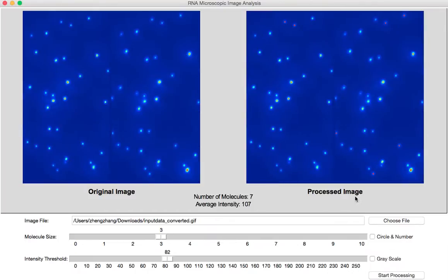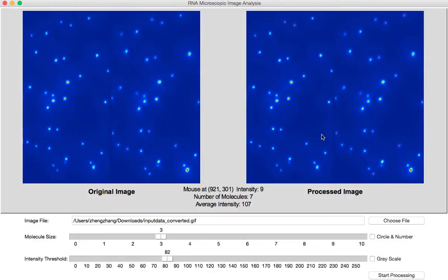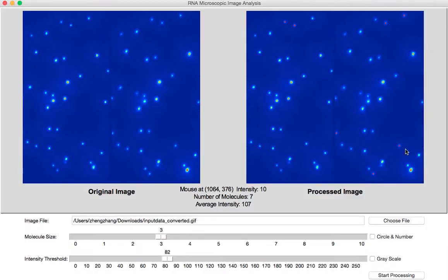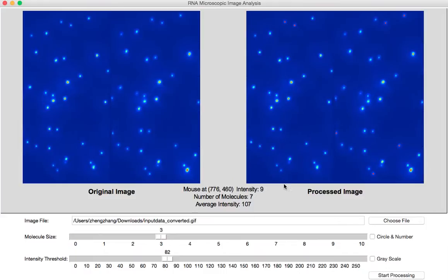Here you go. Now we can see there are some spots on the processed image being highlighted. Those are the spots that we want, the single RNA molecules. In total, there are 7 RNA molecules and their average intensity is 107.